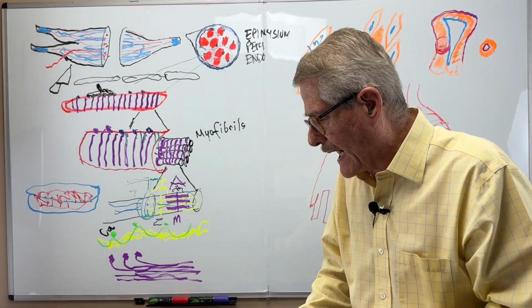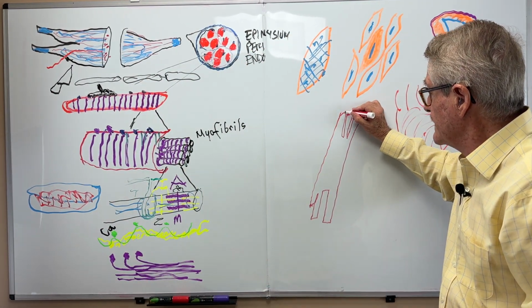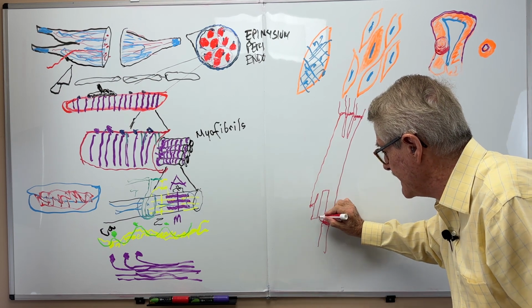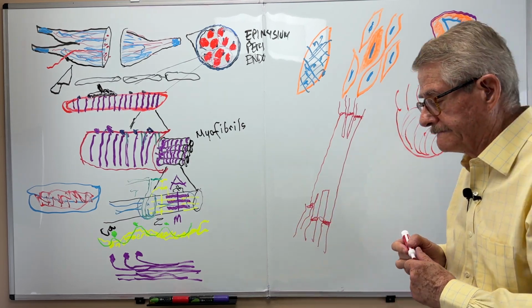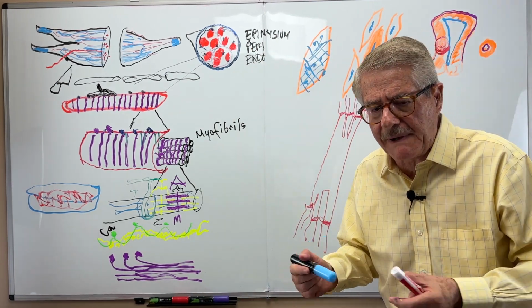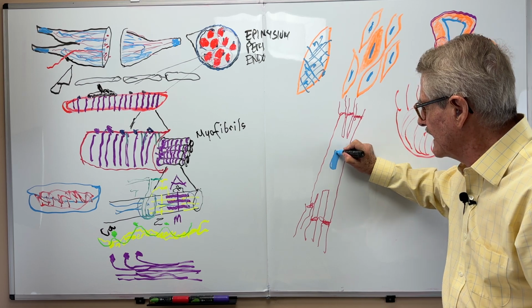And how do they contact the other cells? It is at the very end. So we have here a structure called intercalated discs that make it possible for each cell to be connected to the other cell. The cell is not multinucleated, usually has a single nucleus, but it may have two. And it's a little bit almost rectangular in shape, it's pretty dark.